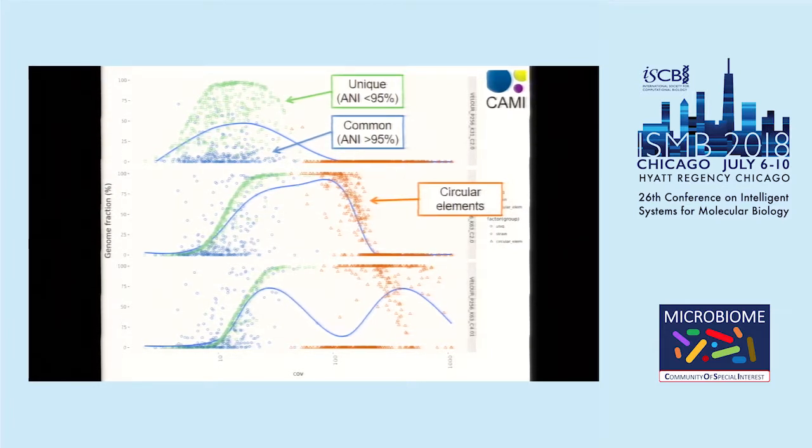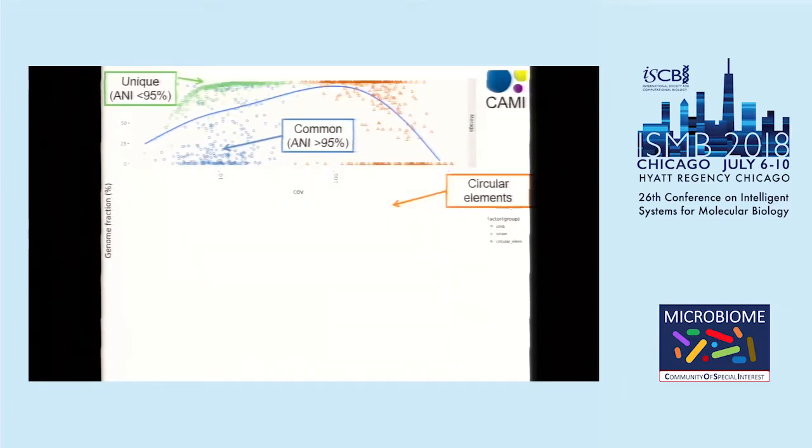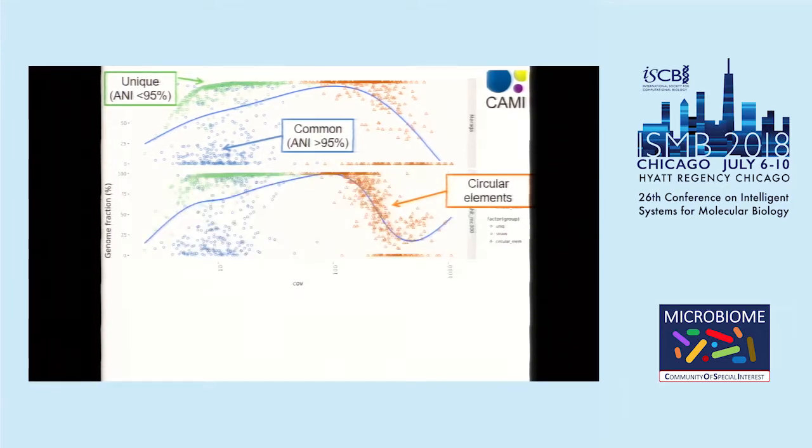And as you can imagine, when you try to combine this, when you do some sort of iterative assembly, which is what the best performing assemblers are doing, they start with small k-mers and iterate across a range of k-mers from, let's say, 21 to 120 or something like this, and then you assemble the whole range of your abundance.